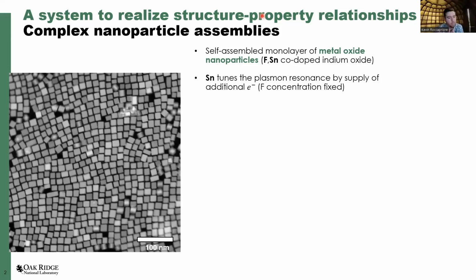So all we care about is the shape of these particles, the organization of the particles, and of course their response that we see through EELS. The property could be anything. We're just going to use EELS because we have access to the low loss spectrum here.